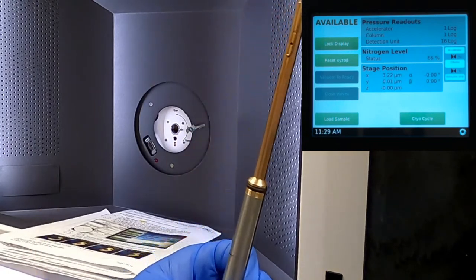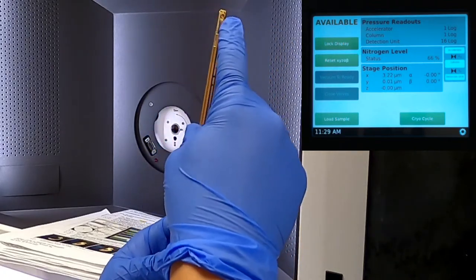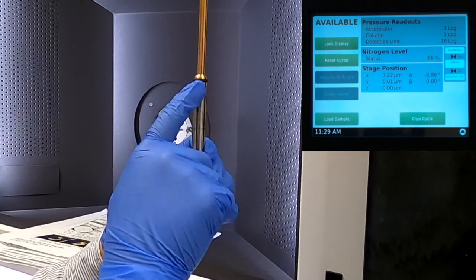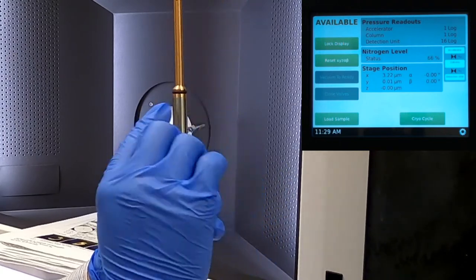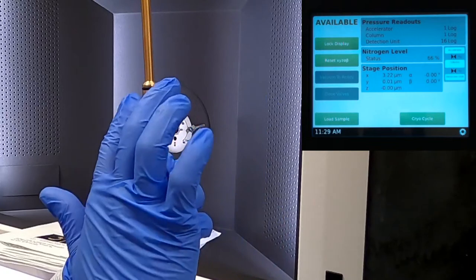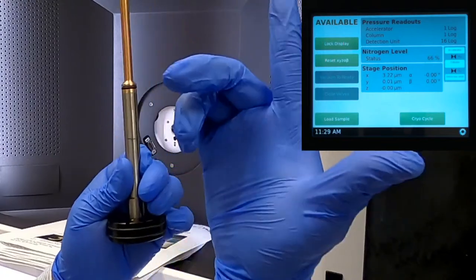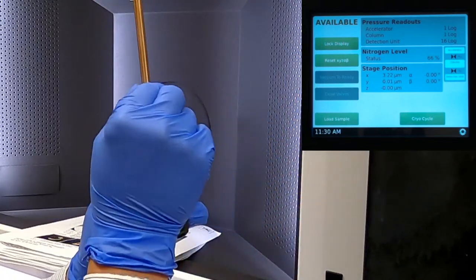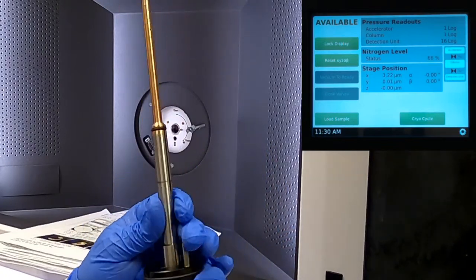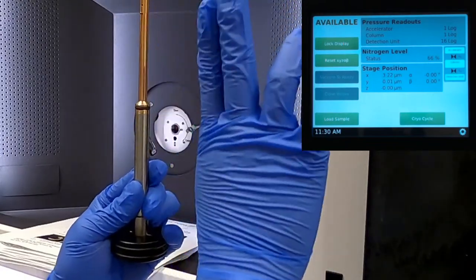So I have loaded the sample on this holder. The sample's actually sitting over here in this tip. And also you see there's an O-ring here. Sometimes if the O-ring is dirty, the vacuum can be bad. So if you ever see any dirt and any debris on the O-ring, you can just wipe it off with a gloved hand, fingers. Do not touch it with bare hands. Okay. And also do not touch the part above the O-rings, because this part is going to stay under the high vacuum.